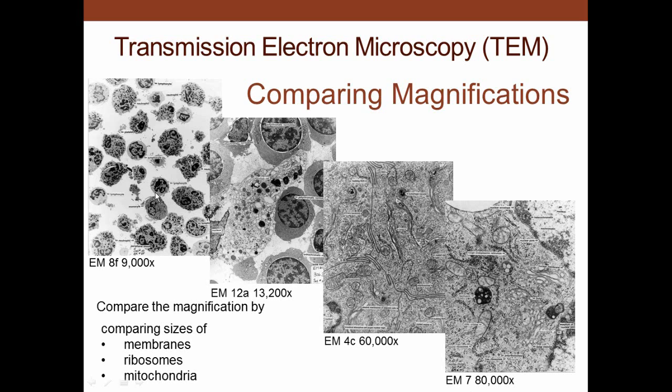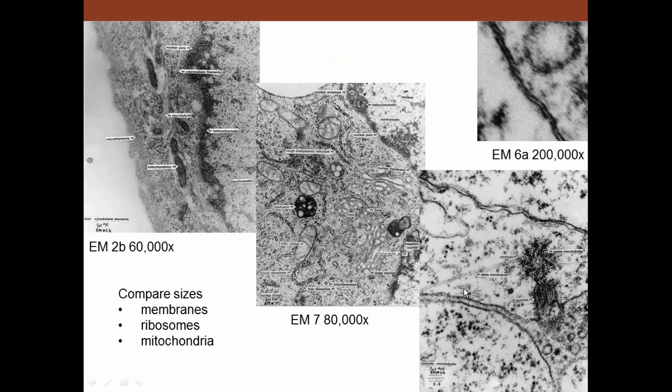Ribosomes, you can hardly see ribosomes. You see the granularity there. A little bit of ribosomes might be able to be seen in through here, this precursor to a red blood cell. See ribosomes here, but here we can see ribosomes at a higher magnification. Here we can see plainly, we can see ribosomes on the rough endoplasmic reticulum. If we look at a little higher magnification, 60,000, you can see ribosomes very nicely in through there. There's polyribosomes, groups of ribosomes here, and here even see that there's actually a couple of units in each of these little ribosomes that we see.